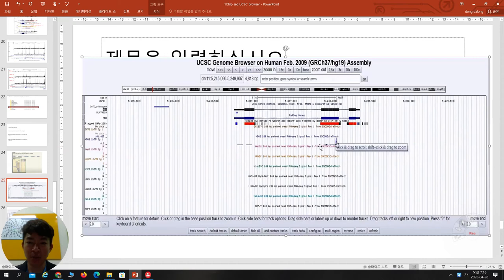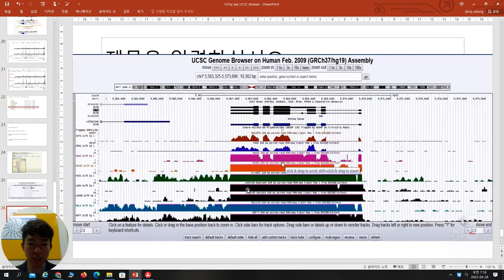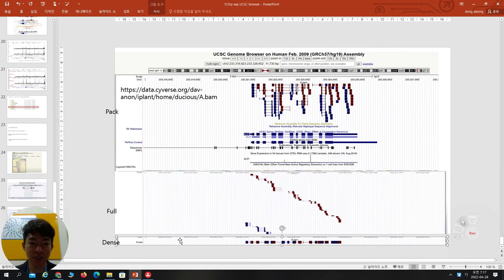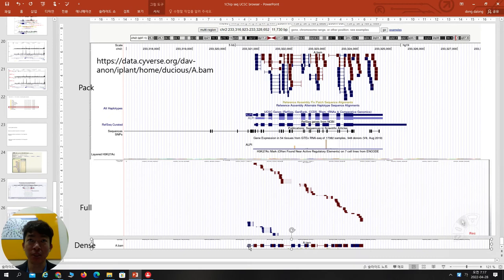When you go to certain sites, you can have this kind of data. Depending on how you analyze it, you can see dense format showing only exons and introns, or full data showing peaks, or pack format which appears as an appeal like here. You can also change which data format you want to display.